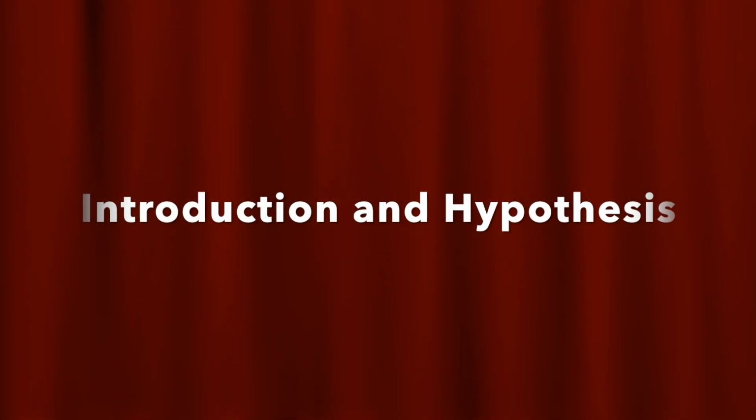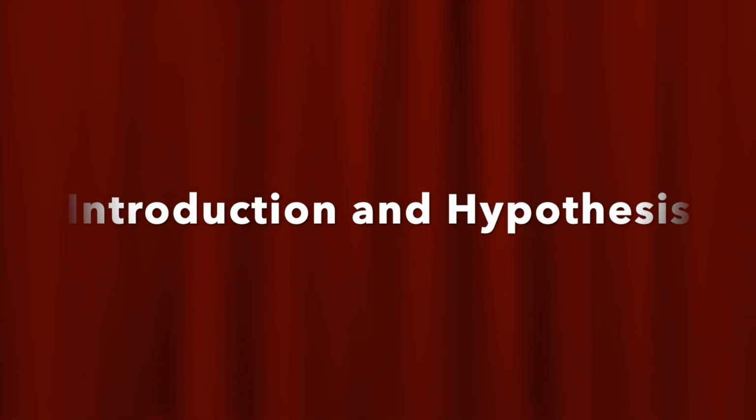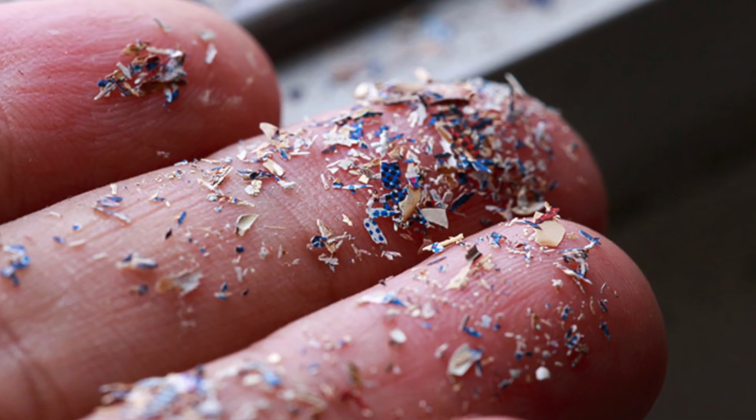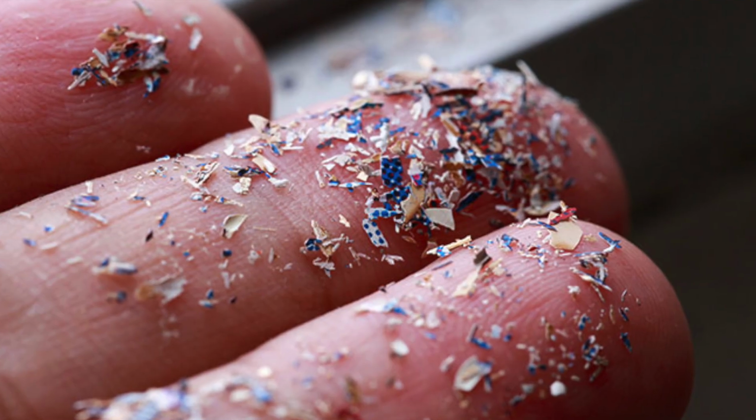In this lab experiment, we set out to compare the amount of microplastics found in different bodies of stagnant and moving water. We hypothesized that the stagnant water will have more microplastics because it is not moving and therefore less likely to filter out any microplastics in the water or deposit them on the shore.